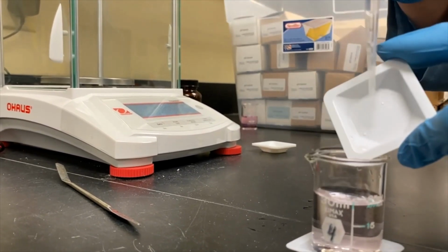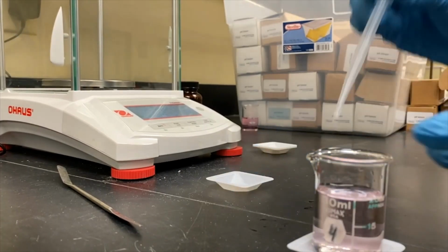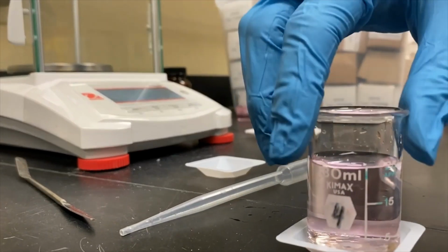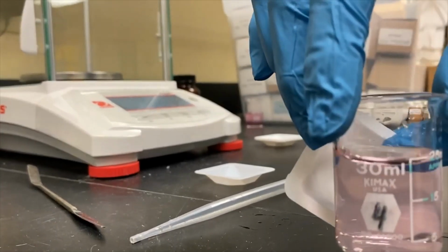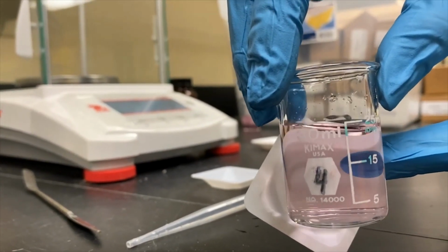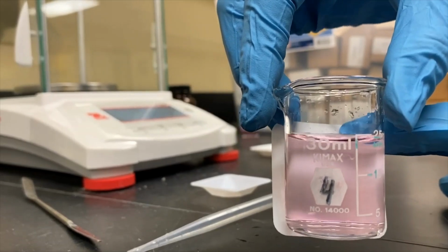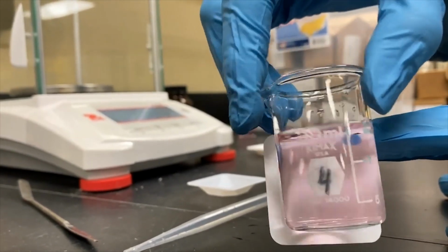And this is not necessarily part of the experiment, but I wanted to show you, A, to demonstrate how DPD works and what it's for, and B, so you can see a little real-world experience, because this is showing us that we have chlorine in our tap water here. And it has gone from a colorless clear solution to a clear solution with some amount of color. So after you do your lab, based on the color, you might be able to estimate how much chlorine we have in the tap water here.